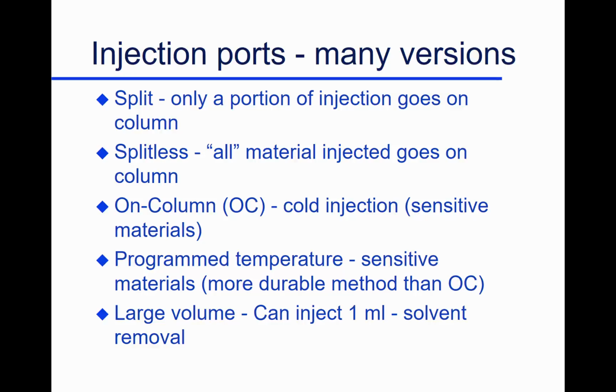Well, supposing our compound doesn't go poof, it goes ugh, and it thermally decomposes. Not a good solution. So for things that don't like that high temperature, we're going to have a system that we can inject into at cold temperatures. And again, you'll see a system coming up where we inject into cold temperatures.